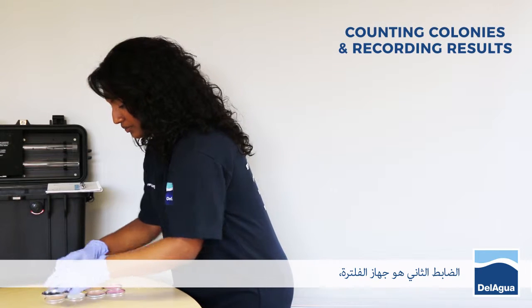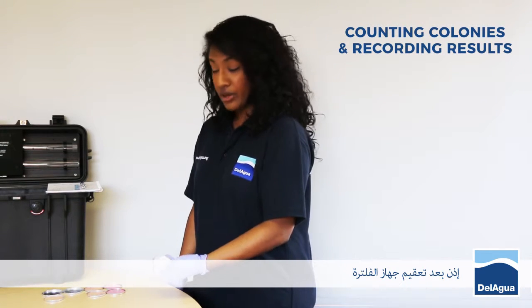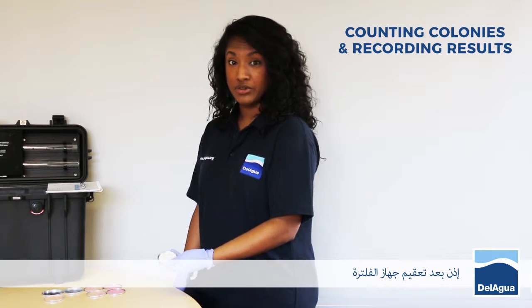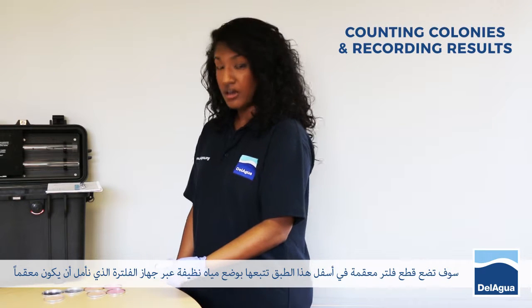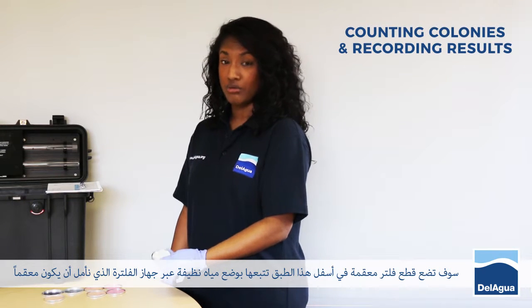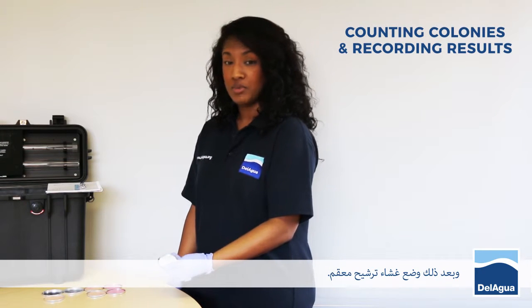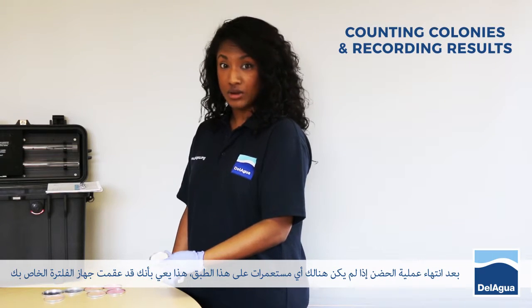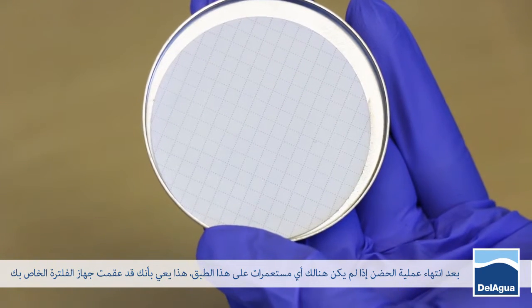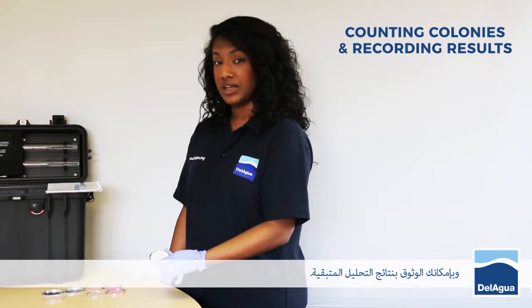The second control would be the filtration apparatus control. Following sterilisation of your membrane filtration apparatus, you would then put a sterile filter pad at the bottom of this dish, followed by clean water run through your hopefully sterilised apparatus, then topped off with a sterile membrane. Following incubation, if this plate has no colonies on, this means that you correctly sterilised your filtration apparatus and you can trust the rest of your results.